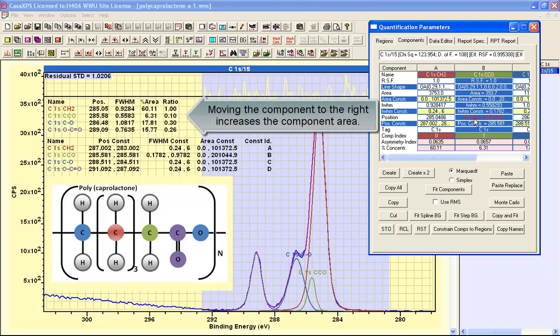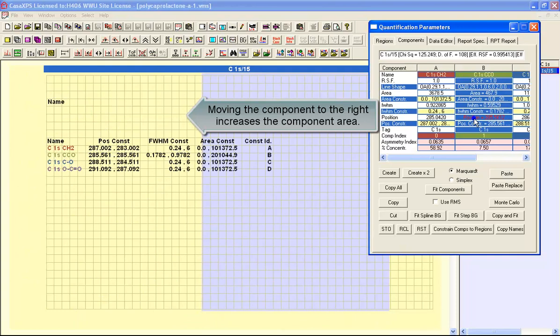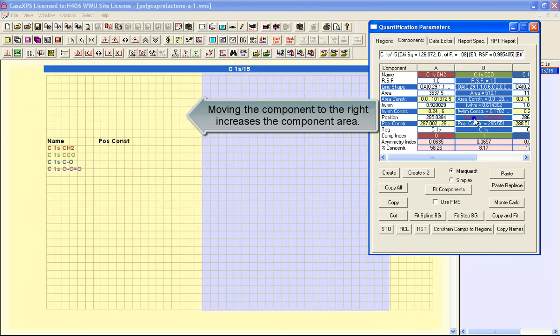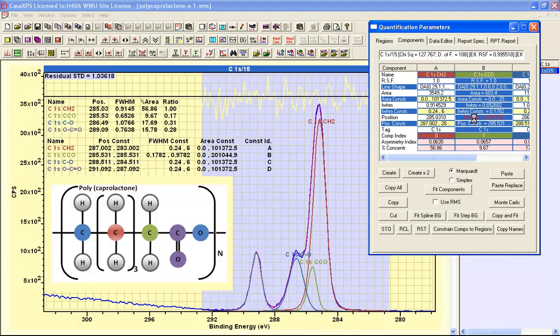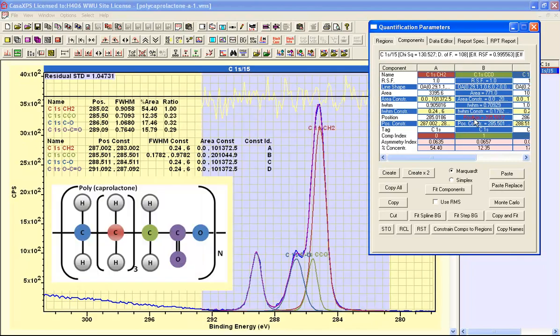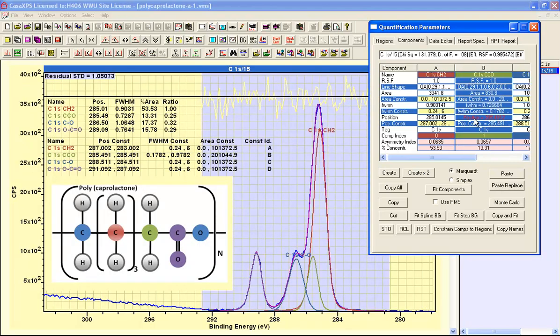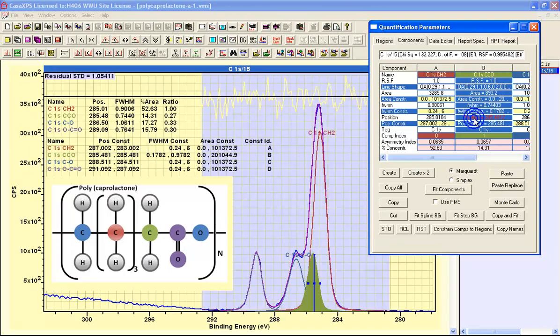So we end up with repeatedly clicking and slightly moving the peak that is producing a much bigger peak as a result of fitting the other peaks, having positioned the one peak as part of this optimization process.